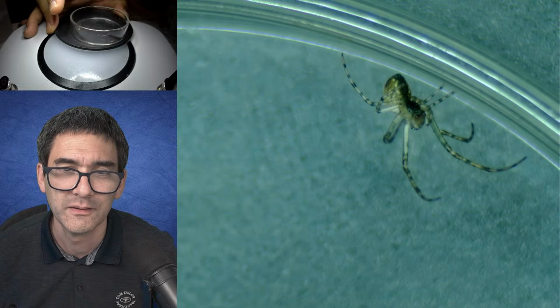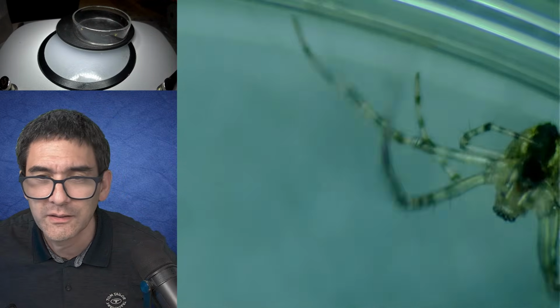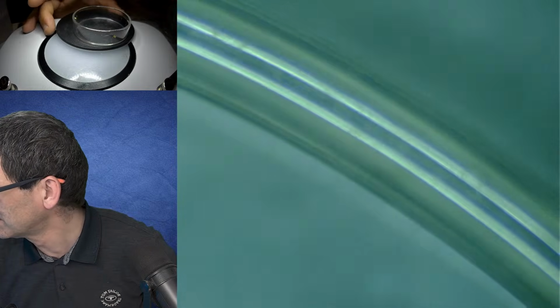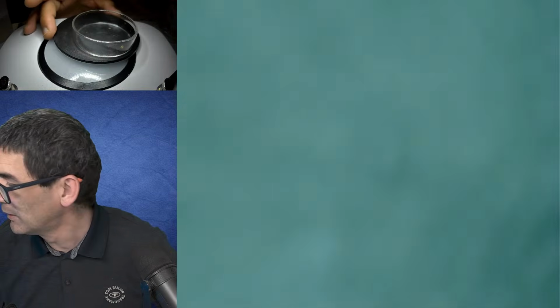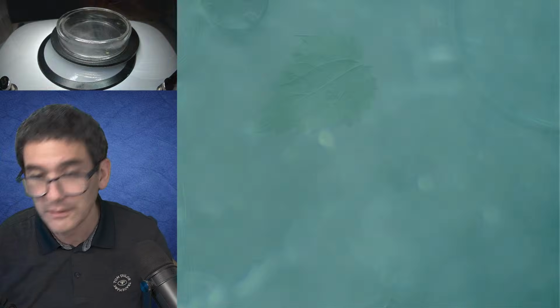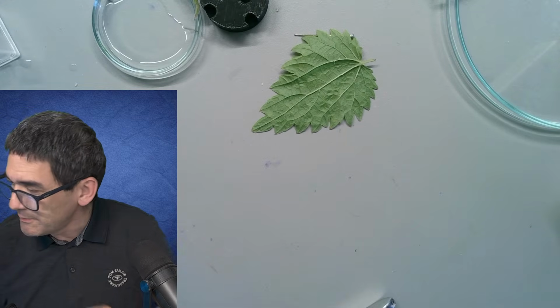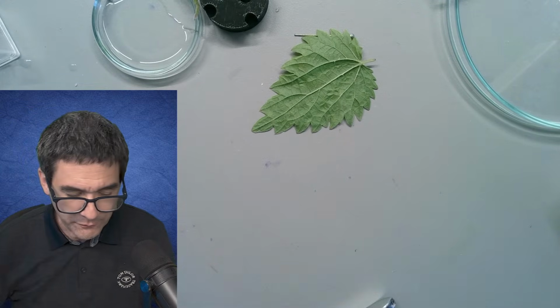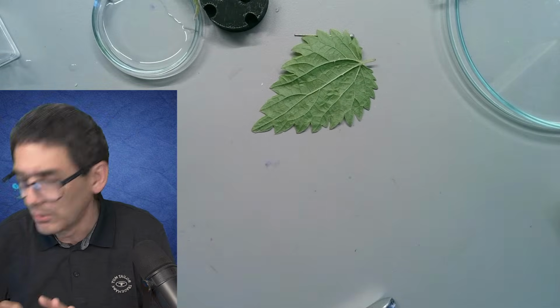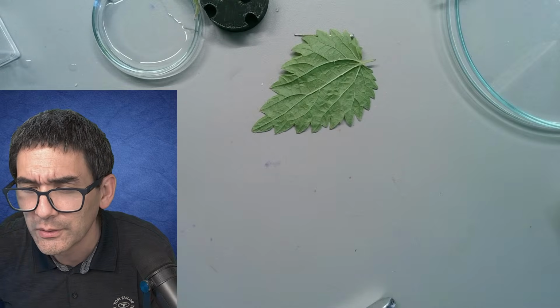So that's every now and then when they start resting. This guy is a little bit. Okay, I think enough. Moving objects are always a little bit difficult to observe, obviously. So let's put a lid again on top, and here we are again. Okay, so what I want to do now is maybe look at a few slides from last week. No, not yet. I'll have a quick look at what some of the comments are.